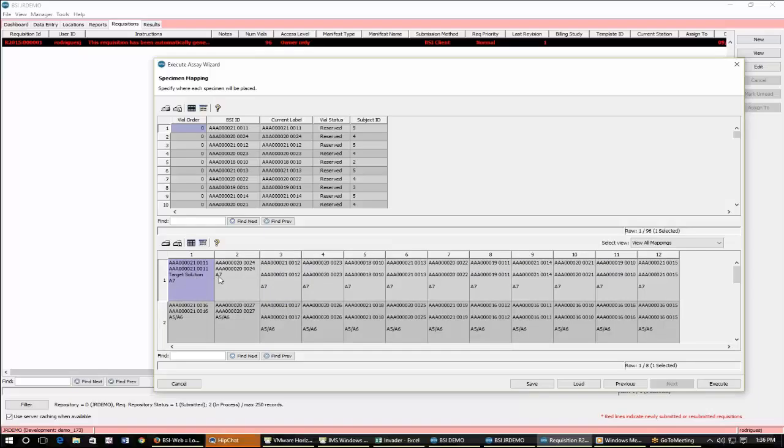And yeah, there's not an option to do that. Okay. But I guess you could use that to set the vial order and then use the vial order to pull the data down to the bottom.